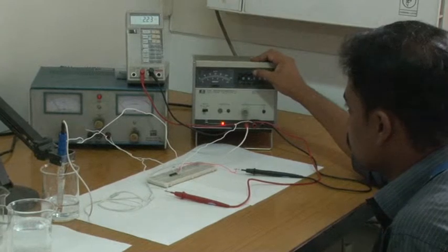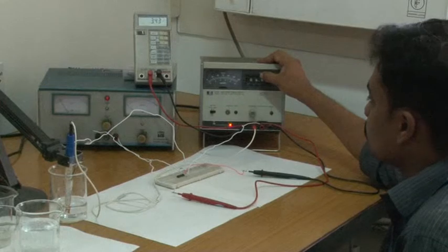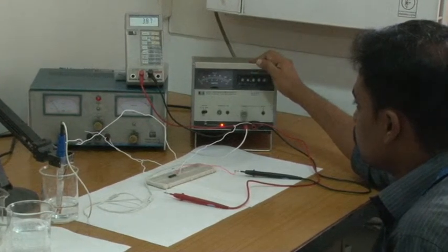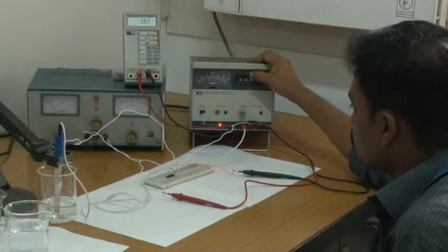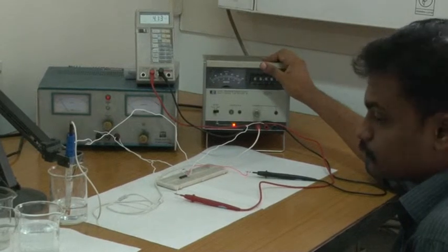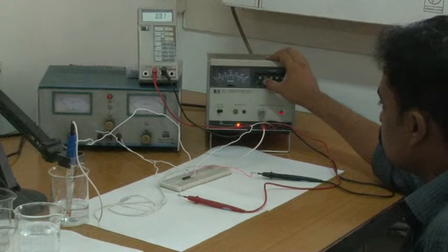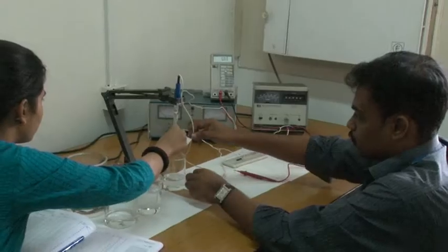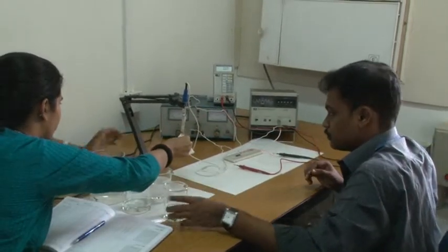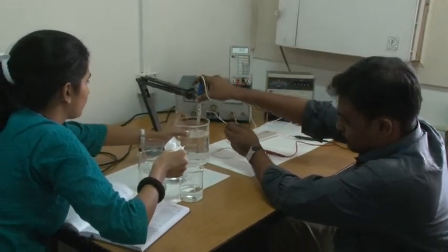We keep changing the reference voltage and observe the change in drain current. Now we change the pH solution from pH 4 to pH 7. Before dipping into the pH 7 solution, we rinse the device with DI water.